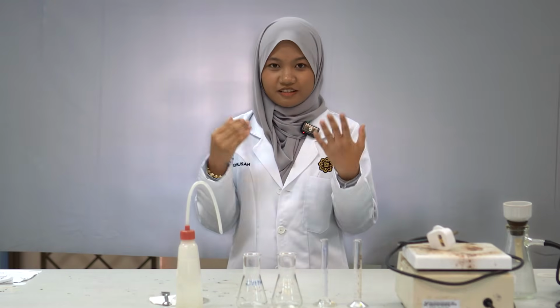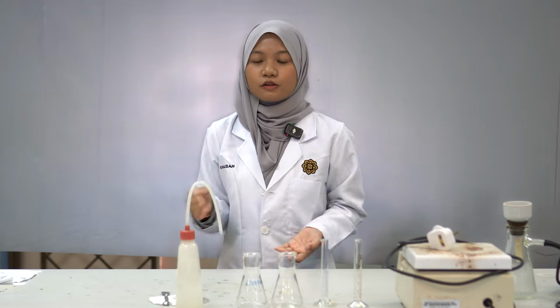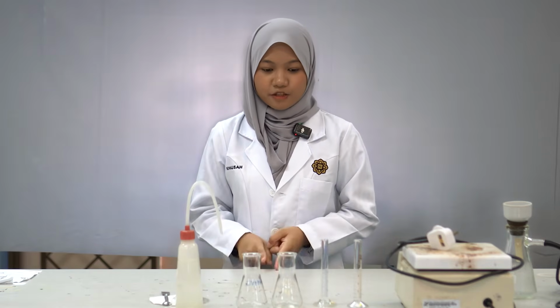Before we start the experiment, safety must come first. For PPE, we must wear goggles, lab coats, gloves, and closed shoes. In this experiment, we use hexane and methanol.